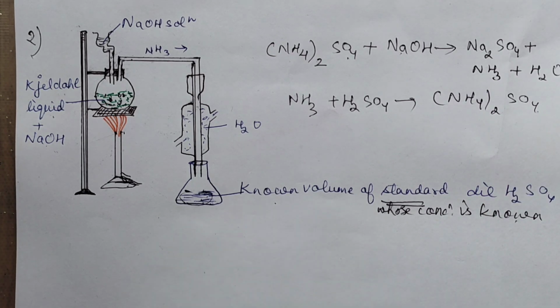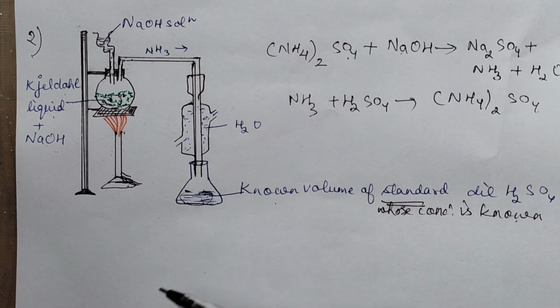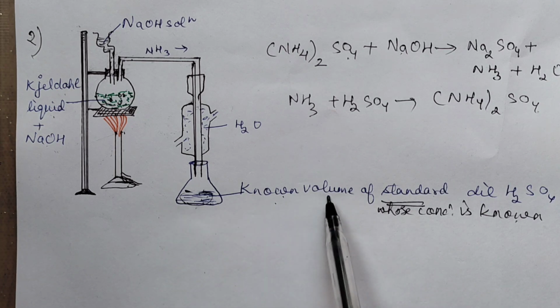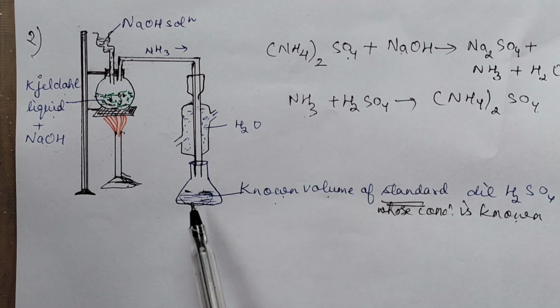Now again in this you will have ammonium sulfate plus you will have a little quantity of sulfuric acid which is left unreacted, because whatever quantity we have taken will not be consumed completely. So whatever we have taken here, the known volume, out of that some quantity would have reacted with this and would have formed ammonium sulfate. So what you have in this, you have ammonium sulfate plus you have the unused sulfuric acid. Got it till here? Okay.